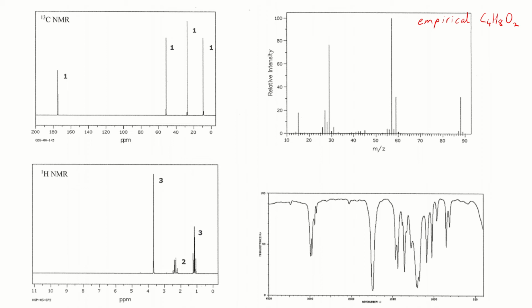This is part of the second assignment, and it's for the merit and distinction bit where what you'll be given is a selection of spectra, and you need to work out the full molecule using them. So the difference between the merit and the distinction is kind of just how well you lay this out, analysing the possible pieces, whether or not there's any alternative structures, and so on. So the merit's more a bit of logic and whether or not you've got the correct structure. The distinction is the full analysis, any possible alternatives, and again, getting the correct structure with that.